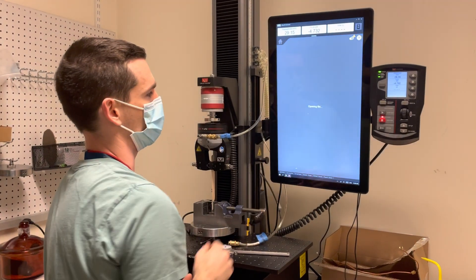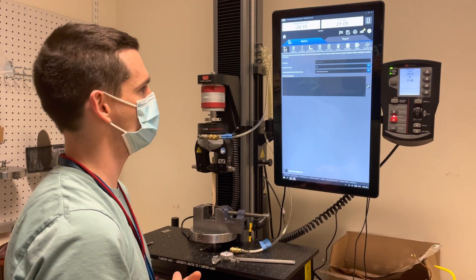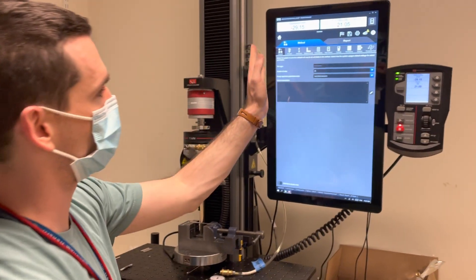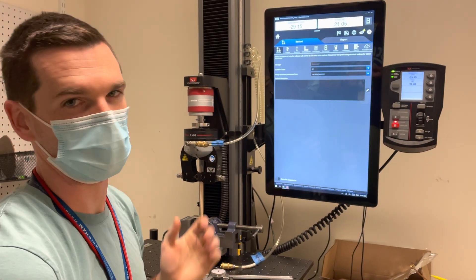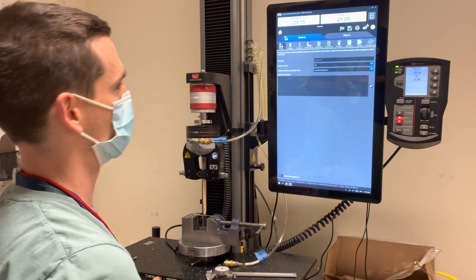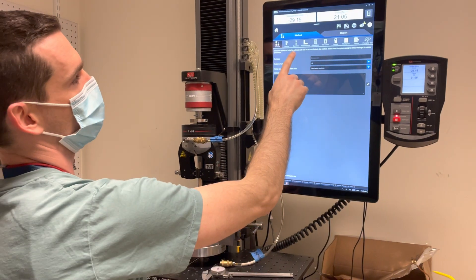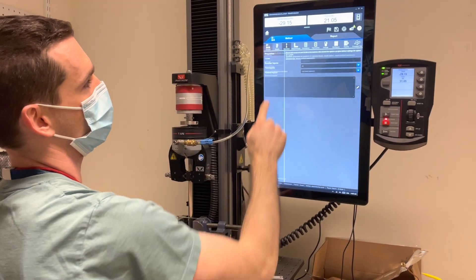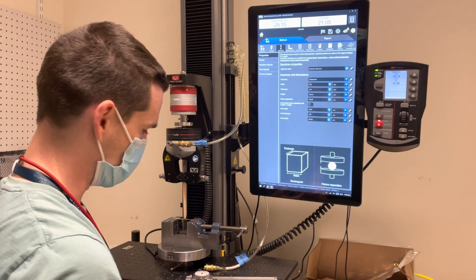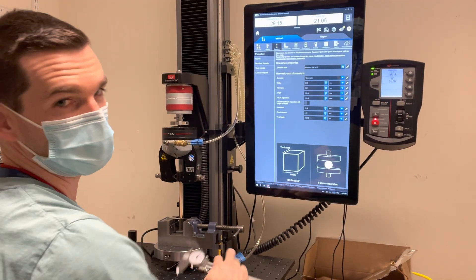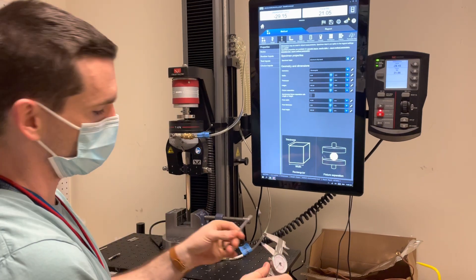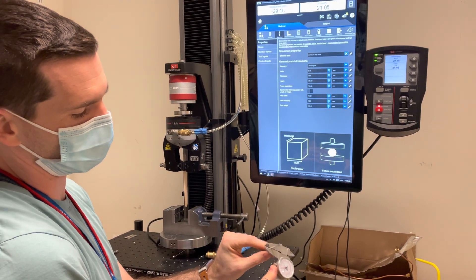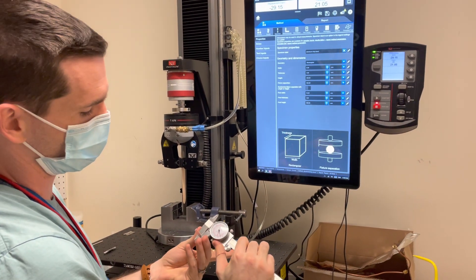I'm going to open the one I previously made and run through all these tabs to show you what the important parts are. The first thing is my specimen. I have calipers here and I need to measure the dimensions of my specimen.